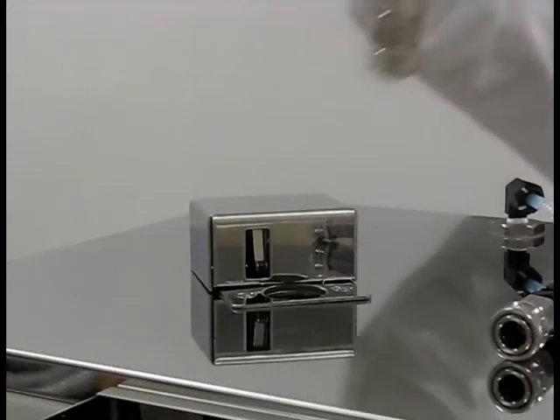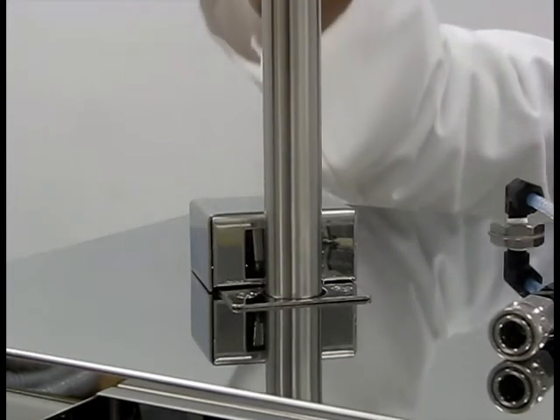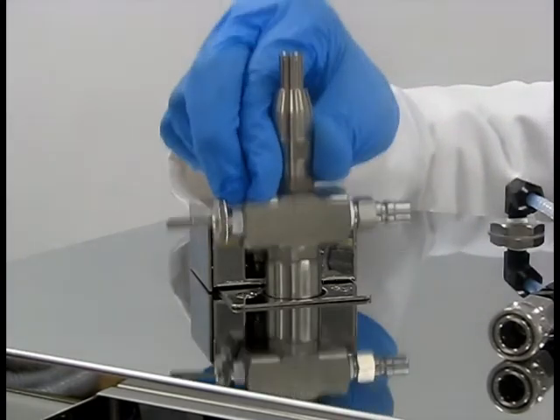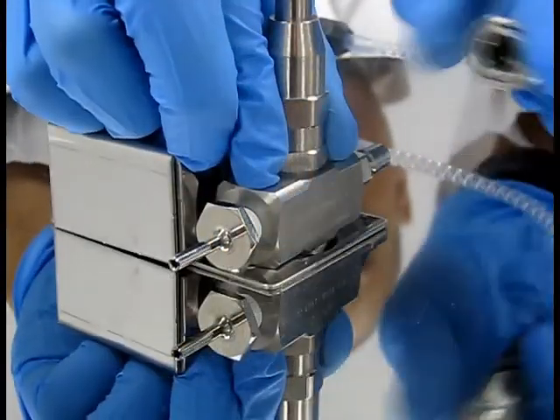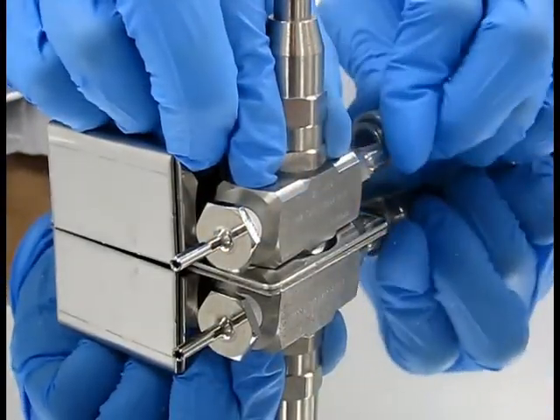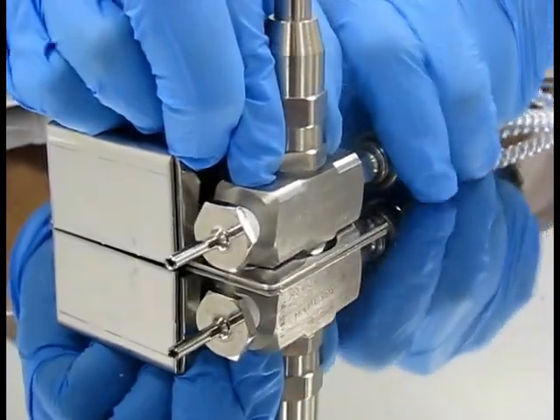Insert the nozzle assembly into the nozzle port on the top of the unit. The assembly will depress a micro sensor in the nozzle detection sensor box when installed correctly. Make sure that the tip marked 'liquid' faces forward, and connect the air spray tube to the air port on the rear of the nozzle assembly.